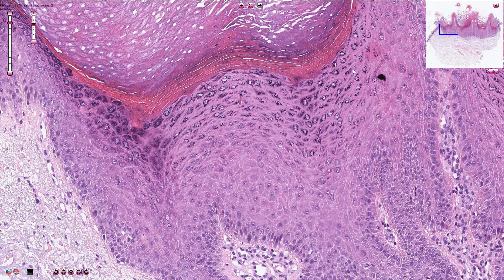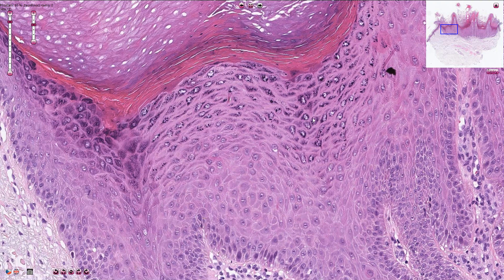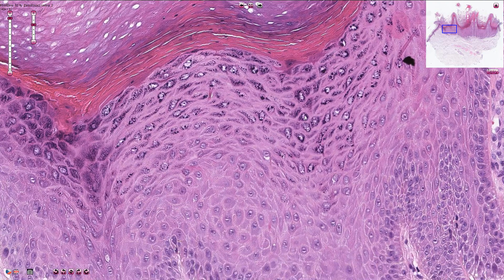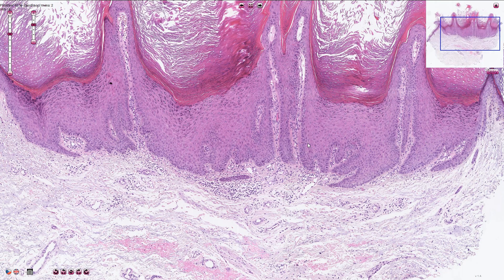In the upper portion of the epithelium we typically see prominent hypergranulosis. All of these keratinocytes in the upper portion of the epidermis have numerous basophilic granules in the cytoplasm. Rete ridges are elongated, and the lateral rete ridges typically point to the center of the lesion, which is a typical morphological sign for Verruca vulgaris.